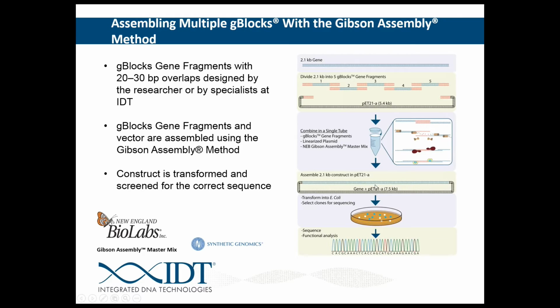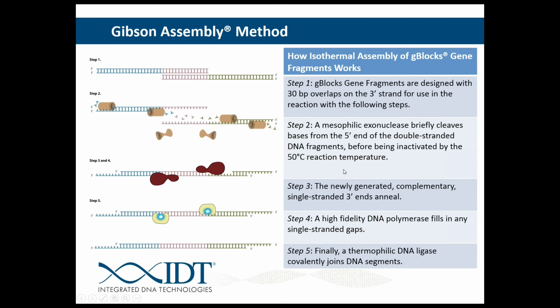So to jump into how this works, I'll zoom in on this a little bit here. The key to this Gibson Master Mix, which is, by the way, provided by New England Biolabs, if you guys would like to purchase it, the key to this are the 3 enzymes that are present in there.